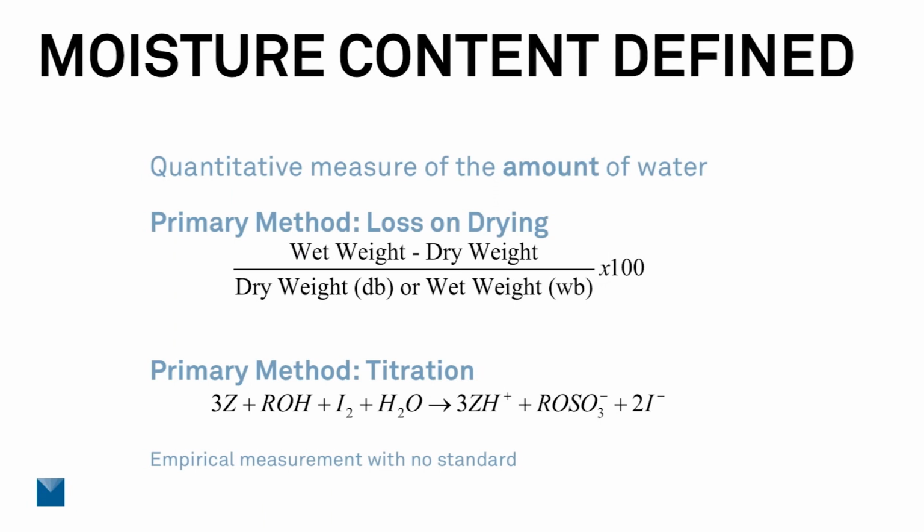There are potential problems with this method, though. One being that all of the water needs to be solubilized and available to react, which can be difficult if your product is not a liquid. And you need to know which solvent to use to be able to do that as well. So there's not really one size fits all for the solvents. There's a main one that does a lot, but that's not always going to be effective for every sample. And there also can be side reactions happening with the solvents, among other things, that can affect that measurement.